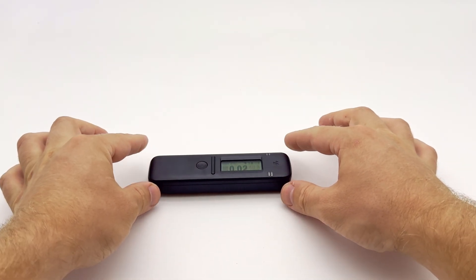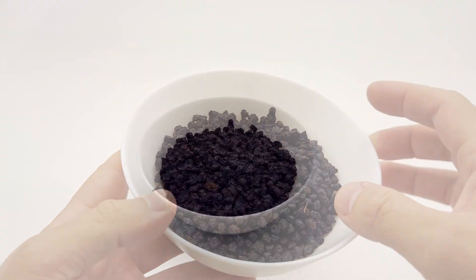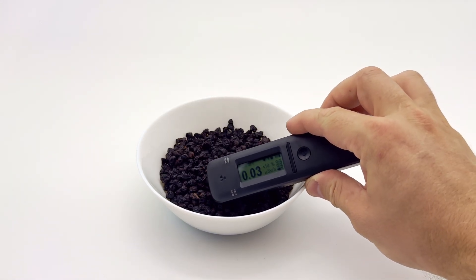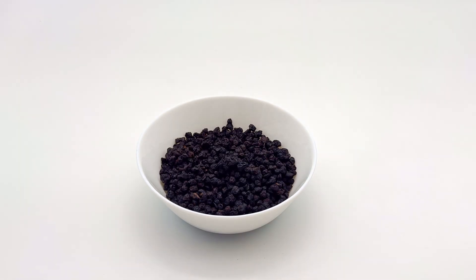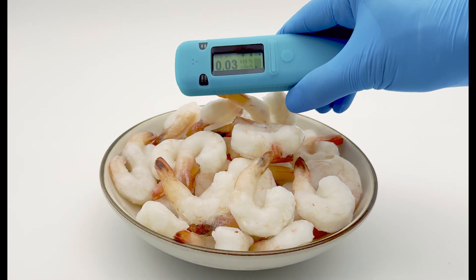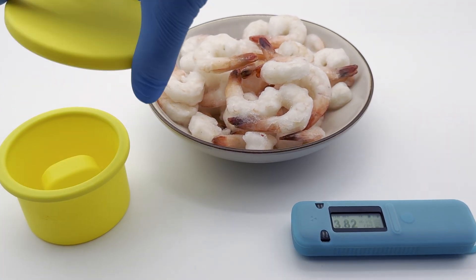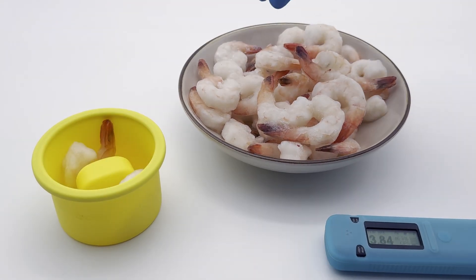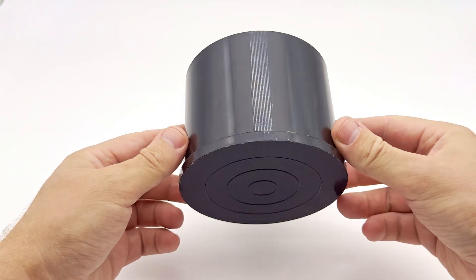First, some important information. Measuring radiation in biological materials, especially in food, is a complex task. Radioactive elements pose a significant health risk when they enter the body through food or inhalation. Even small amounts can be harmful, but most radiation detectors will not register them if simply placed next to the food. A qualitative analysis of food is carried out in laboratories using special methods. Radiocode is the only household device capable of estimating the content of radioactive cesium-137 in food using methods similar to those in laboratories, and can detect even small traces of contamination.